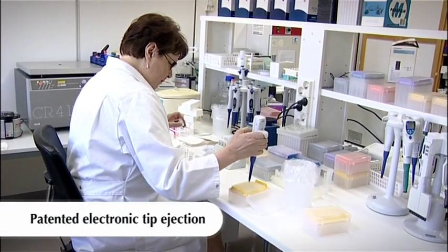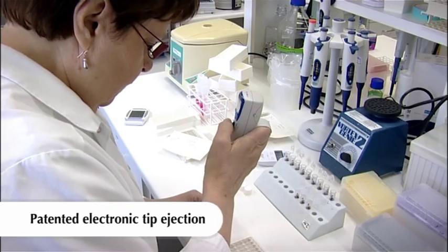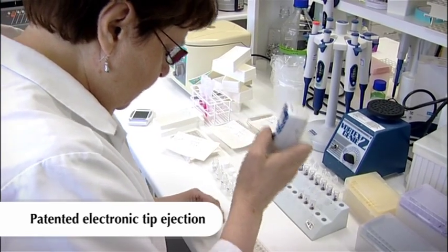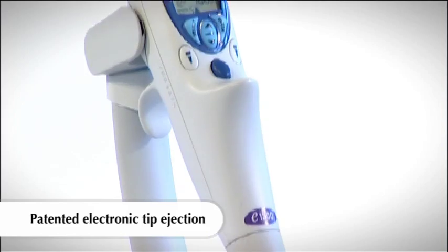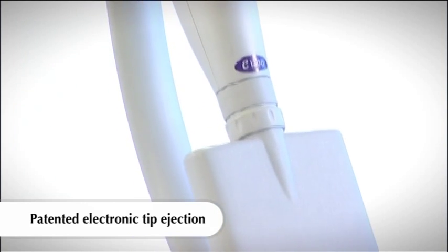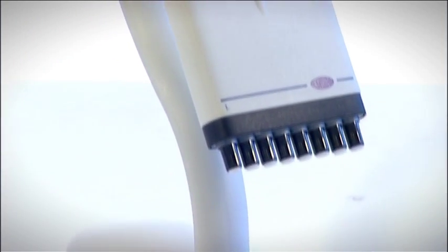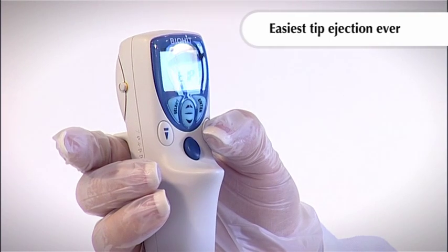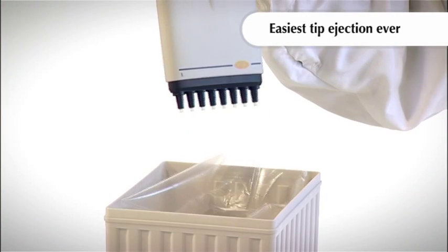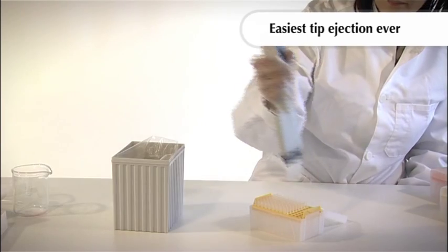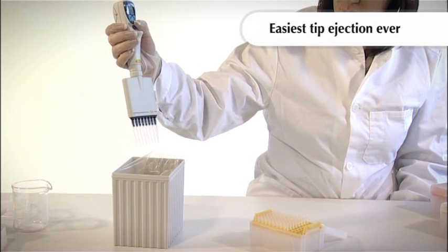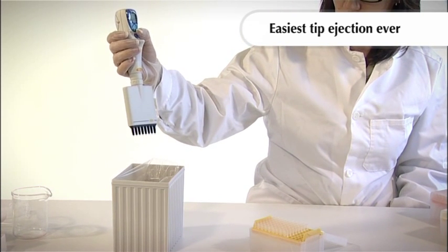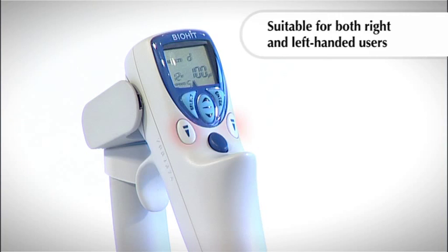Tip ejection can be laborious and, at worst, a contributing factor to strain injuries. E-Line is the only pipette on the market that provides fully electronic tip ejection. Just a feather-light touch is needed to eject the tips. Whether you have one or twelve tips to eject, the touch is the same. The tip ejection key is located on both sides of the keypad and, therefore, suits both left- and right-handed users.